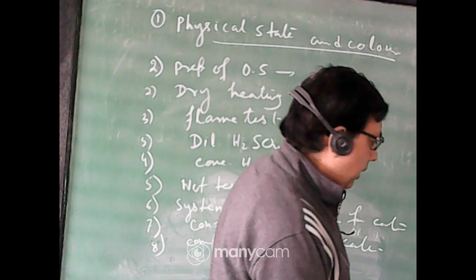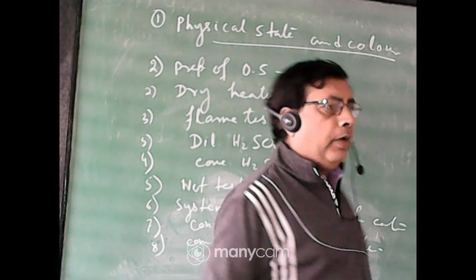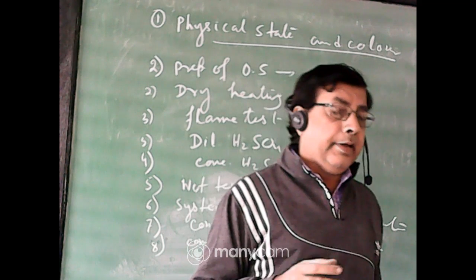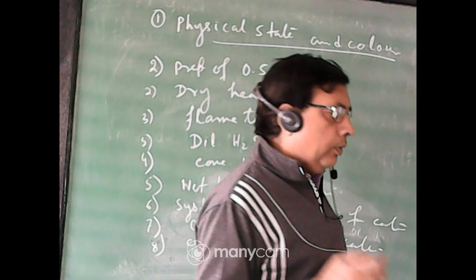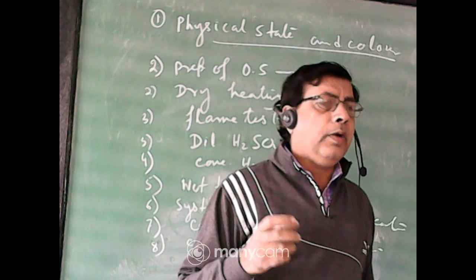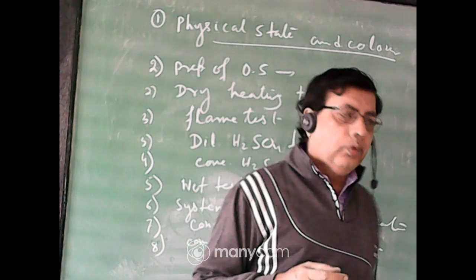Okay. So in the next practical class, it may be Friday, I will perform some other important tests like the nitrate test, an important test for zinc, then the flame test, we will try to show these. Group analysis or salt analysis, I will perform at least 4 practical classes. Today is the first class, another 3 or 4 classes will be done.